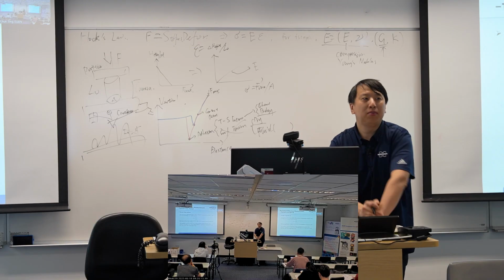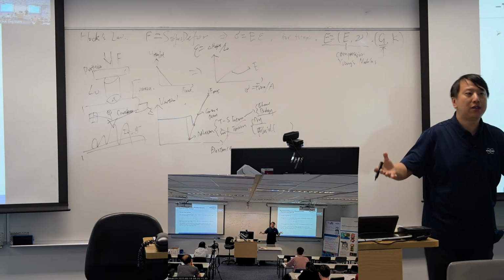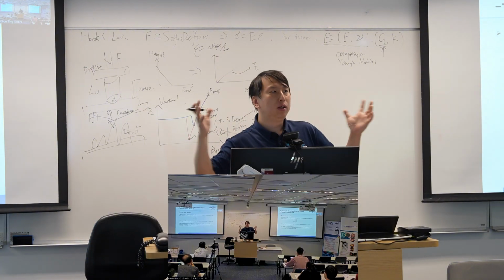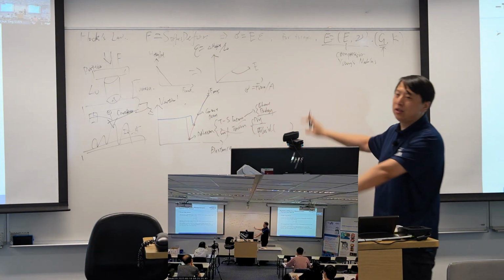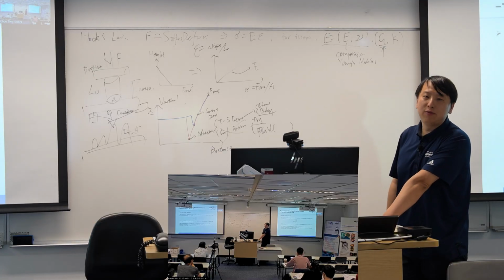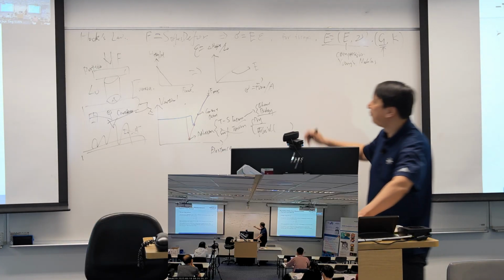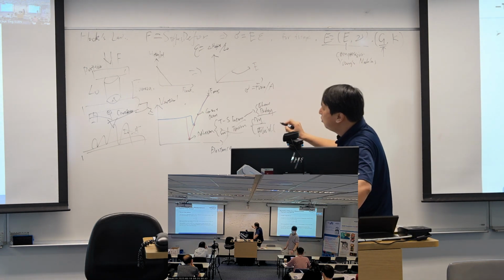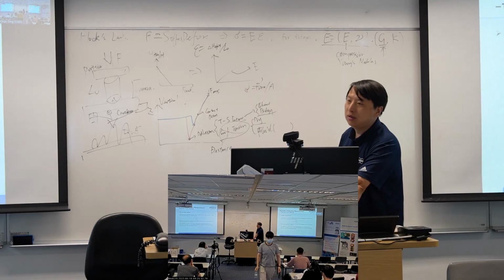For example, you have some ligand and it has its receptor. For example, you have the antigen, you have antibody. You can use this kind of technology to measure the interaction force at the molecular scale. So that's the interaction. But for those, we need to remember, we need to get rid of the surface tension.